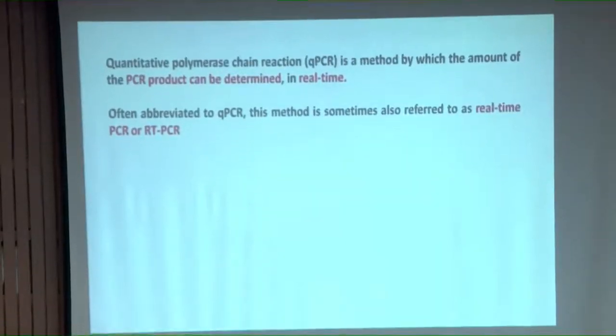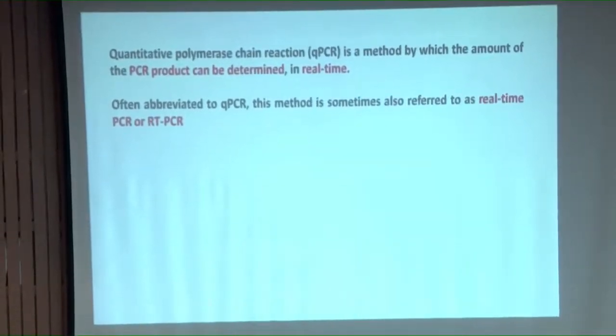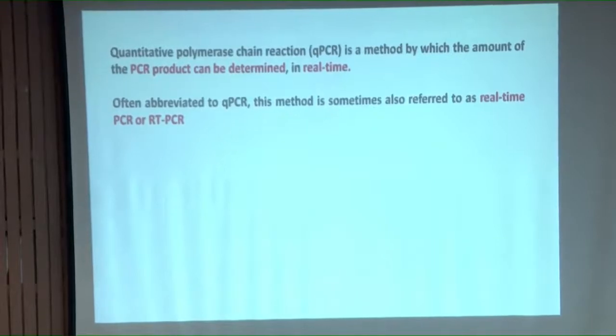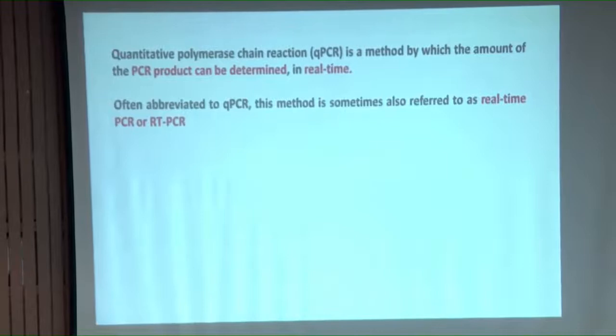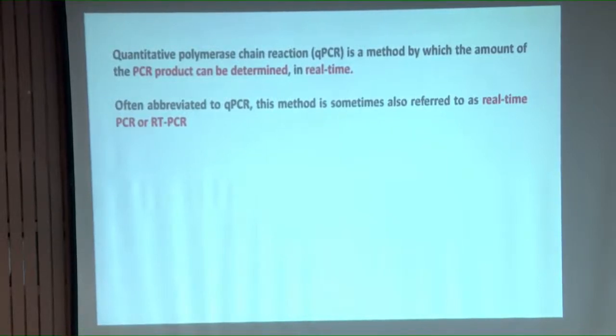This technique is often abbreviated as qPCR. The Q stands for quantitative. That means the conventional PCR is not so quantitative. That's the meaning of it. And it is also referred to as real-time PCR or RT-PCR, right?